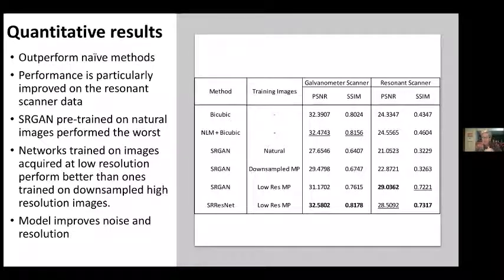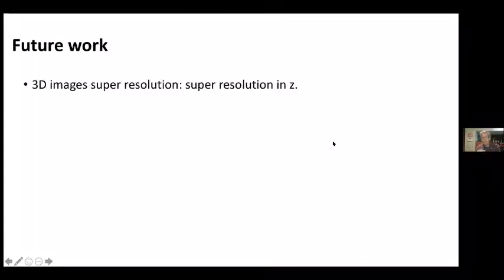So it might be an interesting way to evaluate it in the context of improvement of those results, because sometimes visually something might not look quite right because it doesn't have the right texture, as you saw. But if that texture is really fundamentally random, say photon noise, then that's not key to the task. So that was my observation, that defining success in terms of the final task might be good.